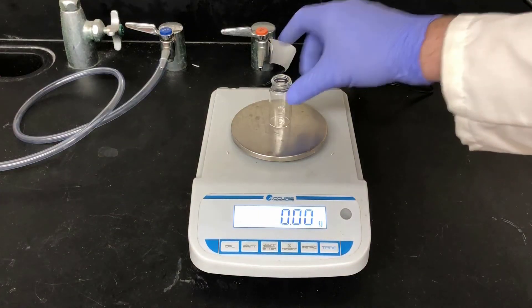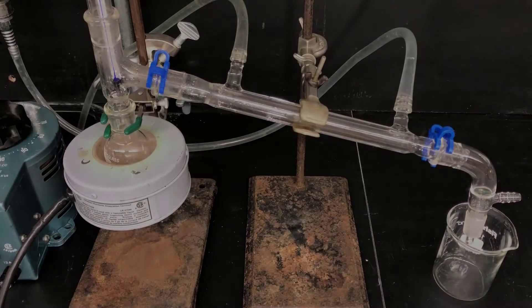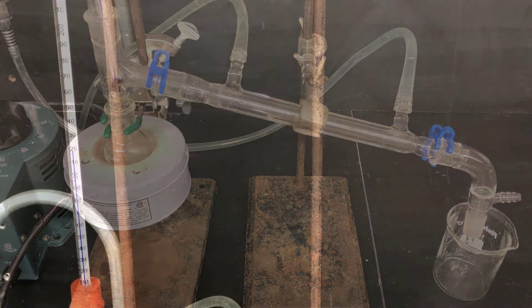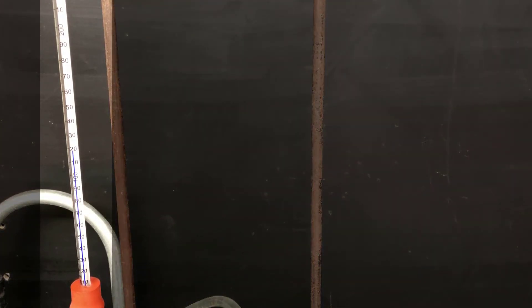Here I'm getting the mass of a clean dry vial — I'll use this to collect the distillate and final product, and get the weight of the product by difference. Here I'm showing the third and final distillation in progress. The point of this distillation is to purify the dehydration product, 2-methyl-2-pentenal. It's possible that unreacted propanal still may be present, so it's important to only collect the fraction that boils in the appropriate range. Literature values for the boiling point of this compound range from 130 to 136 degrees Celsius.